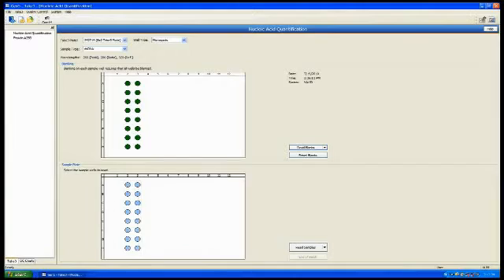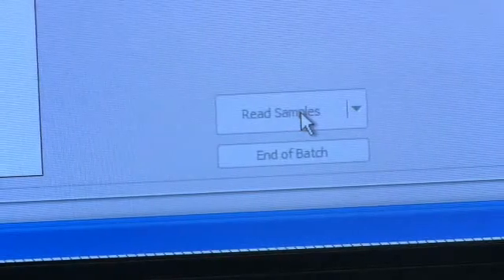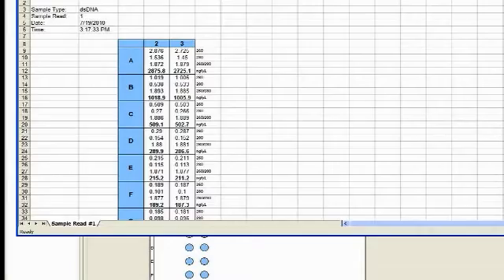Select all 16 locations and read the plate. The results are calculated automatically and displayed in an Excel sheet.